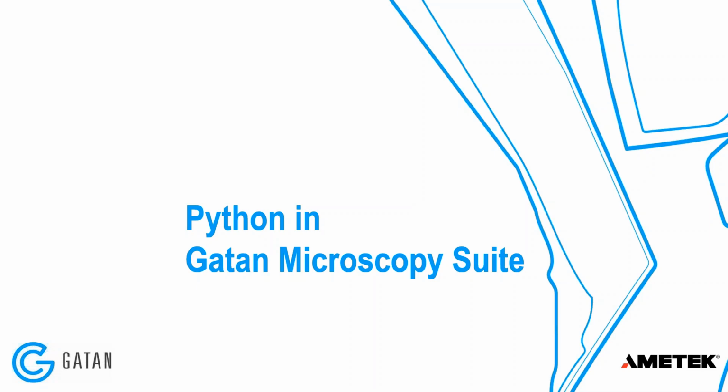And so the first thing I want to say as I start this webinar is a bit about what I hope to accomplish in this webinar and what this webinar is not. So it's not meant to be a tutorial on how to get started using Python in GMS.